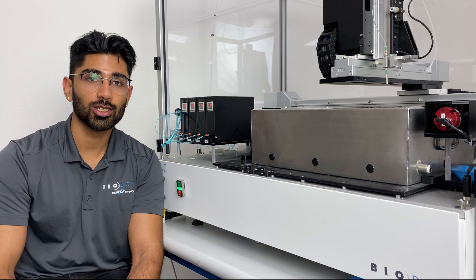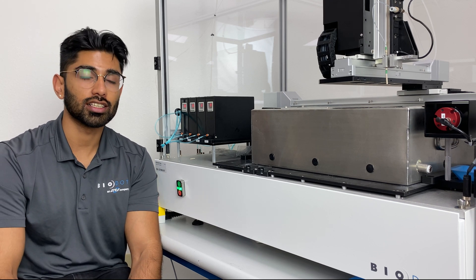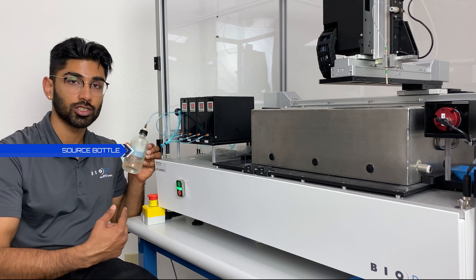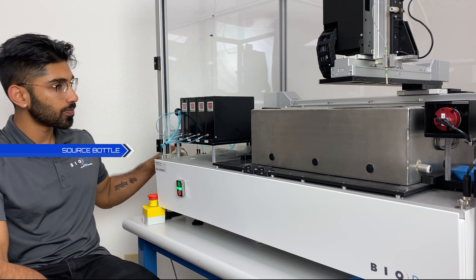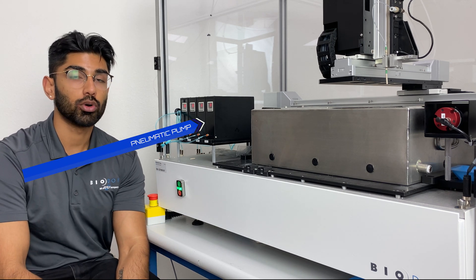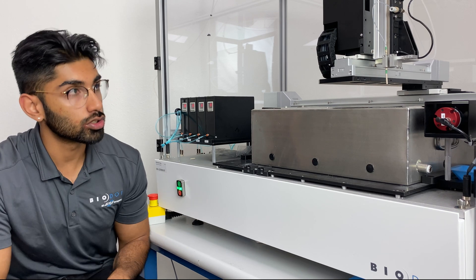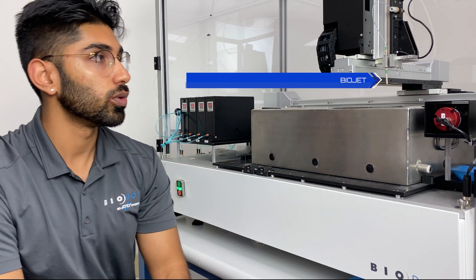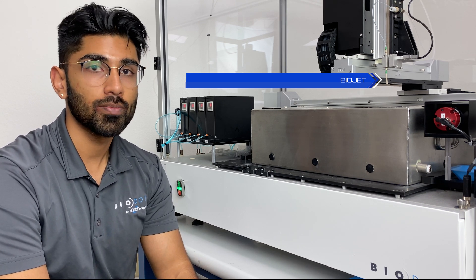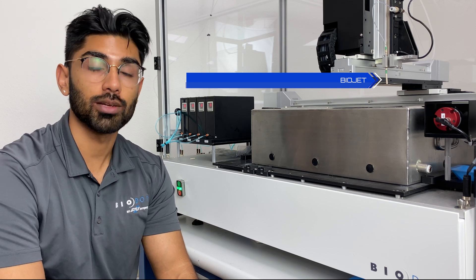Now let's take a closer look at the Sphere system components. The source liquid loaded into the machine is first placed into a source bottle on the side of the machine. This source bottle is connected to pneumatic pumps that push the liquid out of the source bottle and towards a dispenser tip, which consists of a solenoid valve that opens and closes to allow the liquid to go through, and a customizable tip that can be modified to allow for different volumes.